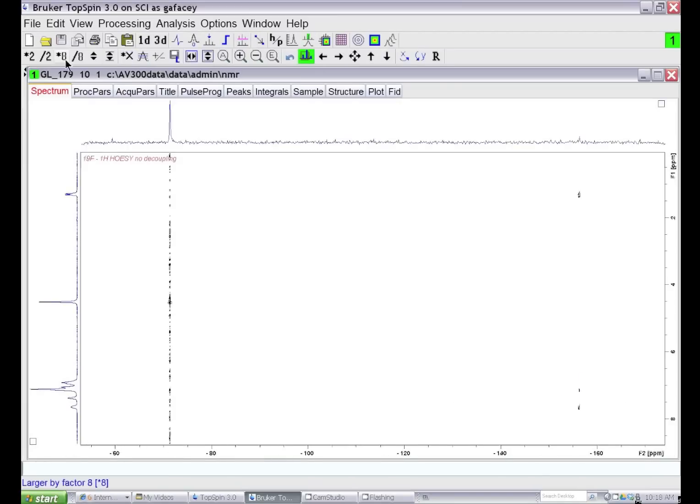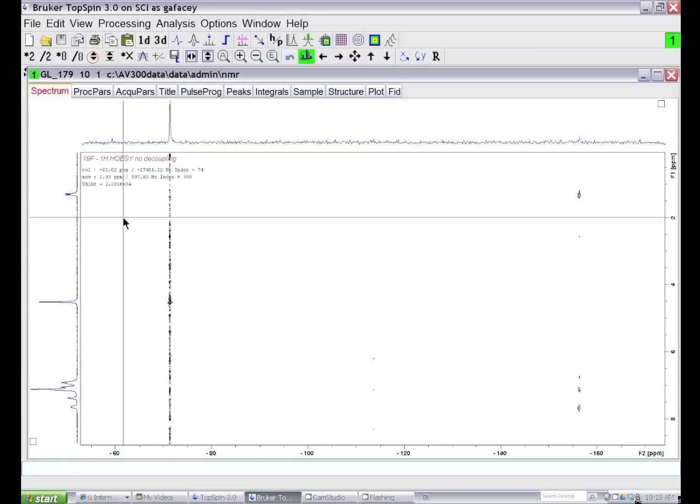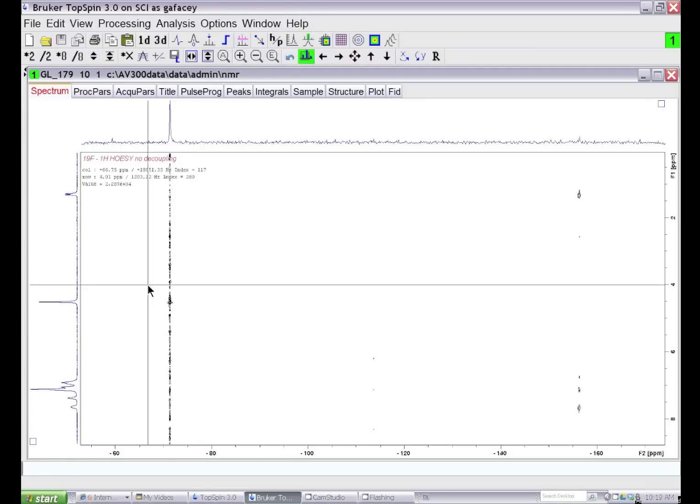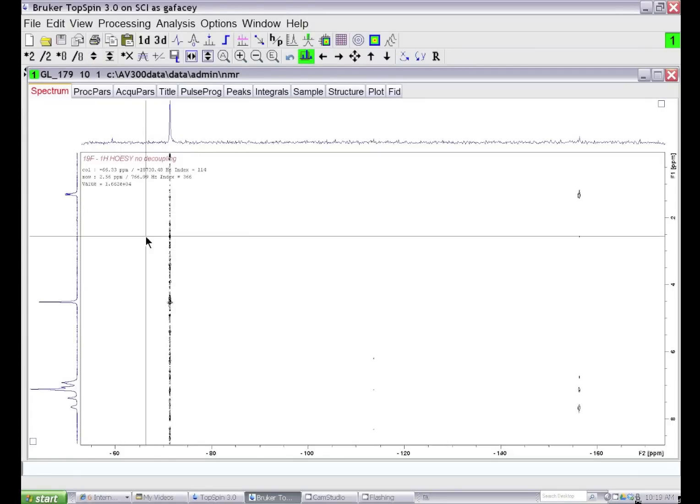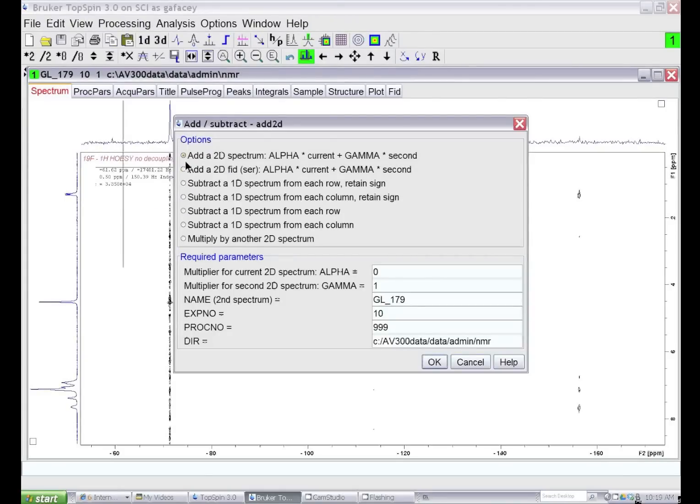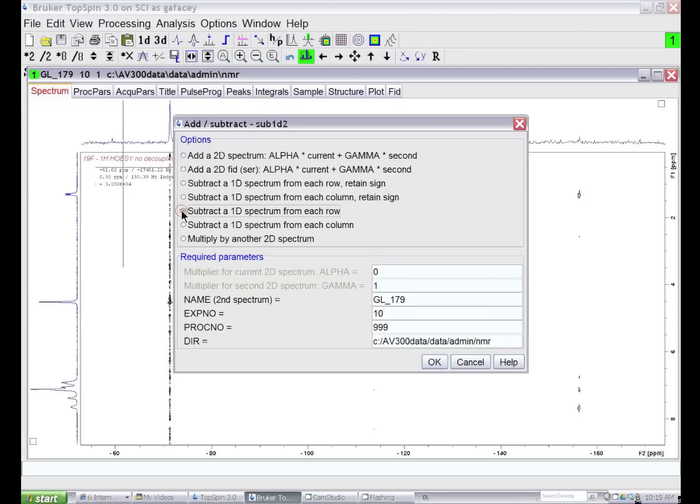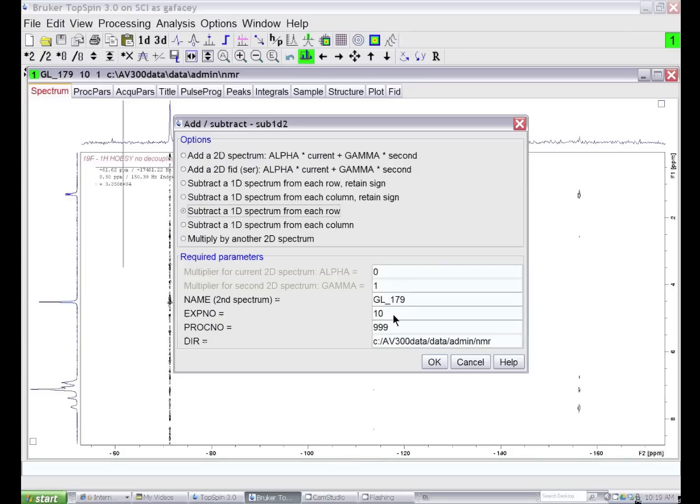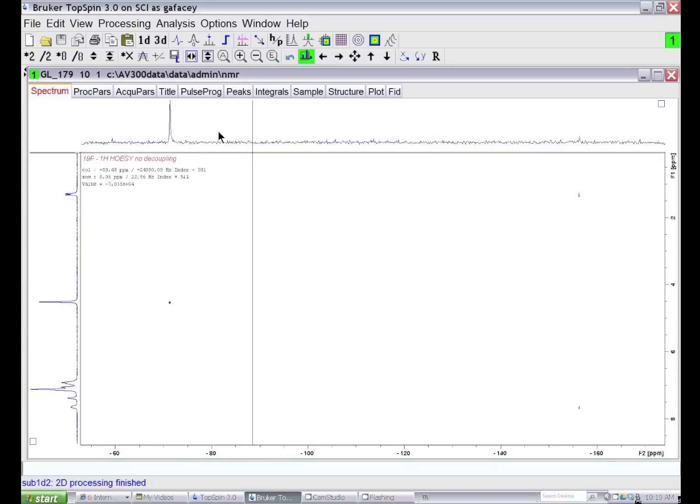Here is our two-dimensional NMR spectrum that we want to subtract the T1 noise from. Go under Processing and Add, Subtract, Multiply. We want to subtract a one-dimensional spectrum from each row. Select this option and tell it where to find that. This dataset is named GL_179, experiment number 10. We stored the projection in process number 999, and this is the directory on my computer for the dataset. If I click OK, I will subtract that projection from each row.